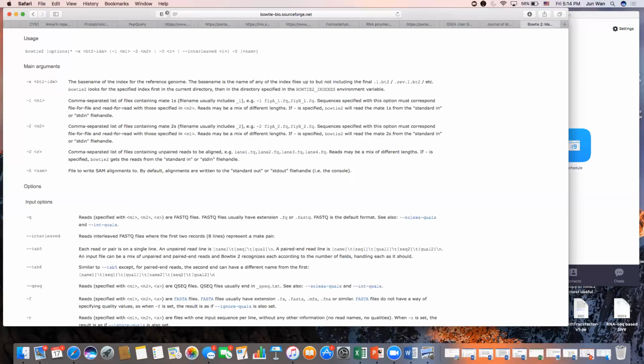He is amazing. Then you're going to see a -1, -2. That's just in reference to the FASTQ files. Then -S tells it to write the SAM file. You name the SAM file. You can put out.sam, you can put control.sam. I always call it whatever the sample is that I'm working with. This way I'm never confused about what sample I have. So for example, on the first one, I would call it control.sam, okay?